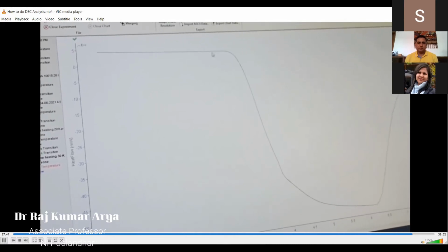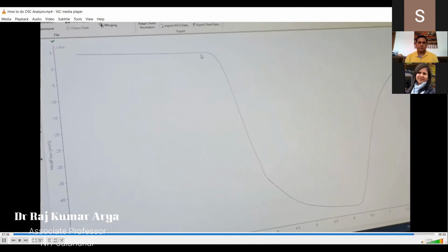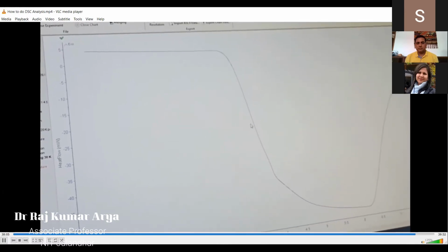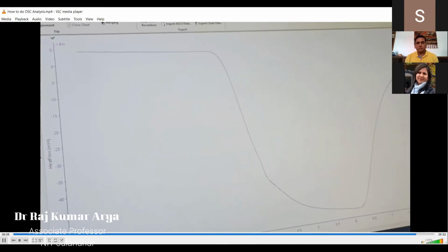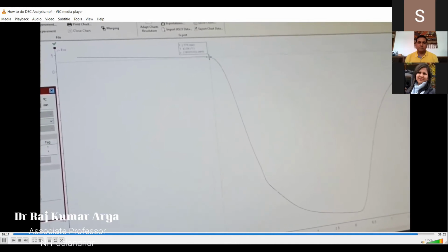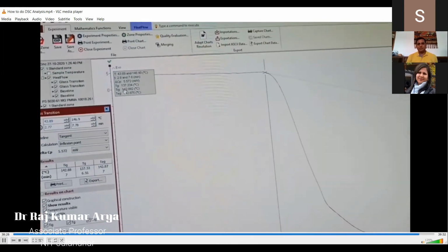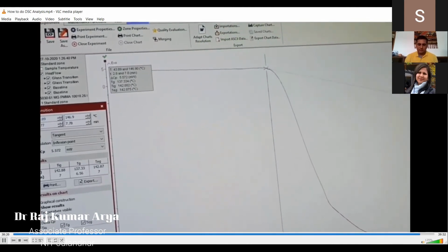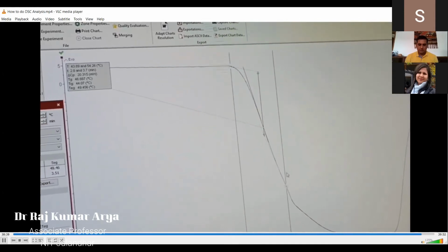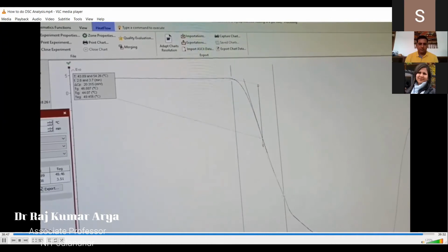You will see here it is gaining energy, and there's again gaining. So here you are heating in the beginning, and here you have some change. After that there is some change, and then it is decreasing and decreasing. After that it is gaining some energy further. So if you find, let's say, TG for this sample, and if this one is your change, you can say the TG is 137, which is impossible, because you are not doing something correct. So this end may be somewhere here. Here it could be slightly reasonable, but you cannot be sure about this point, because here it's not the end of the transition, it keeps on going and going.